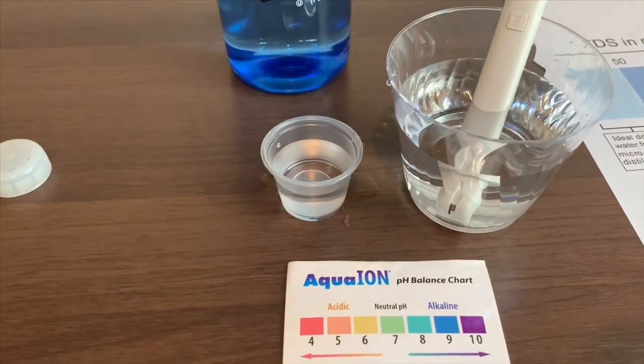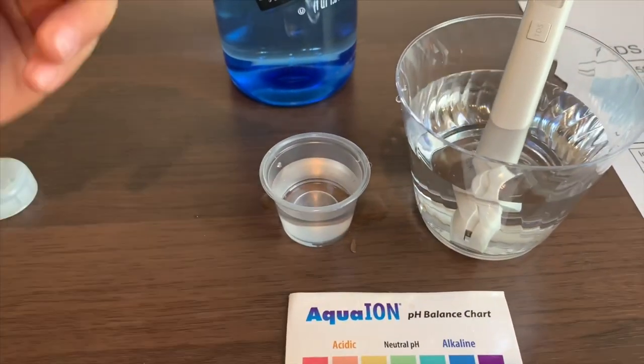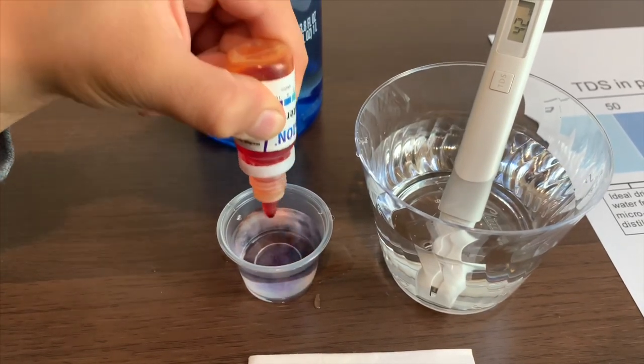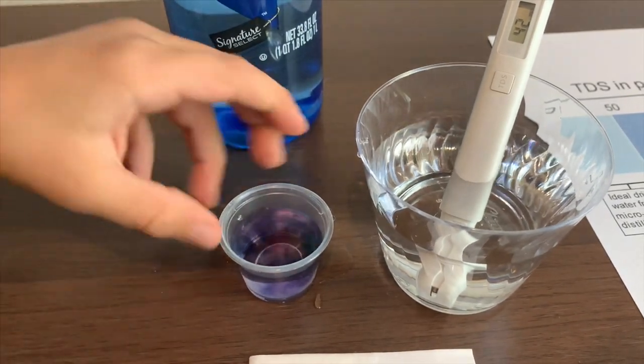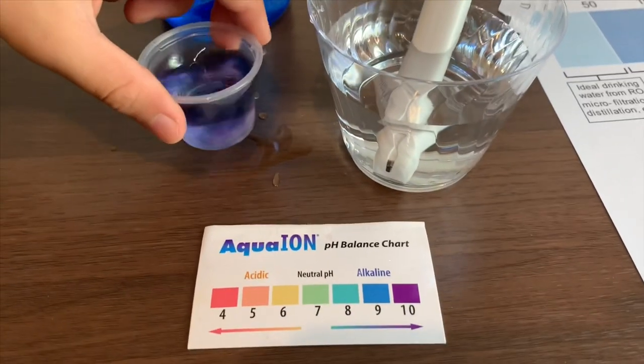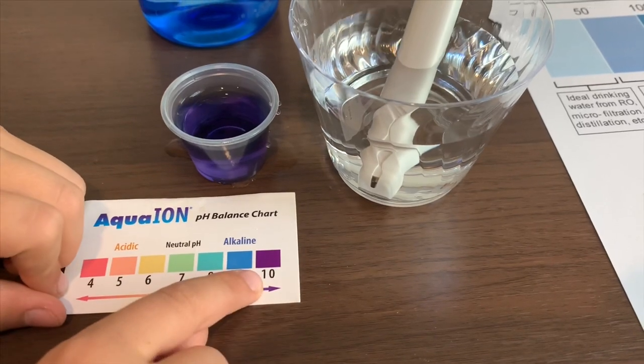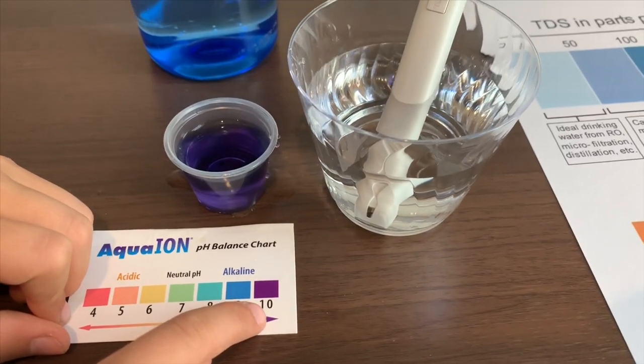Now, let's test the pH level. Let's only do two drops. I give this a 10. That means it is good alkaline water.